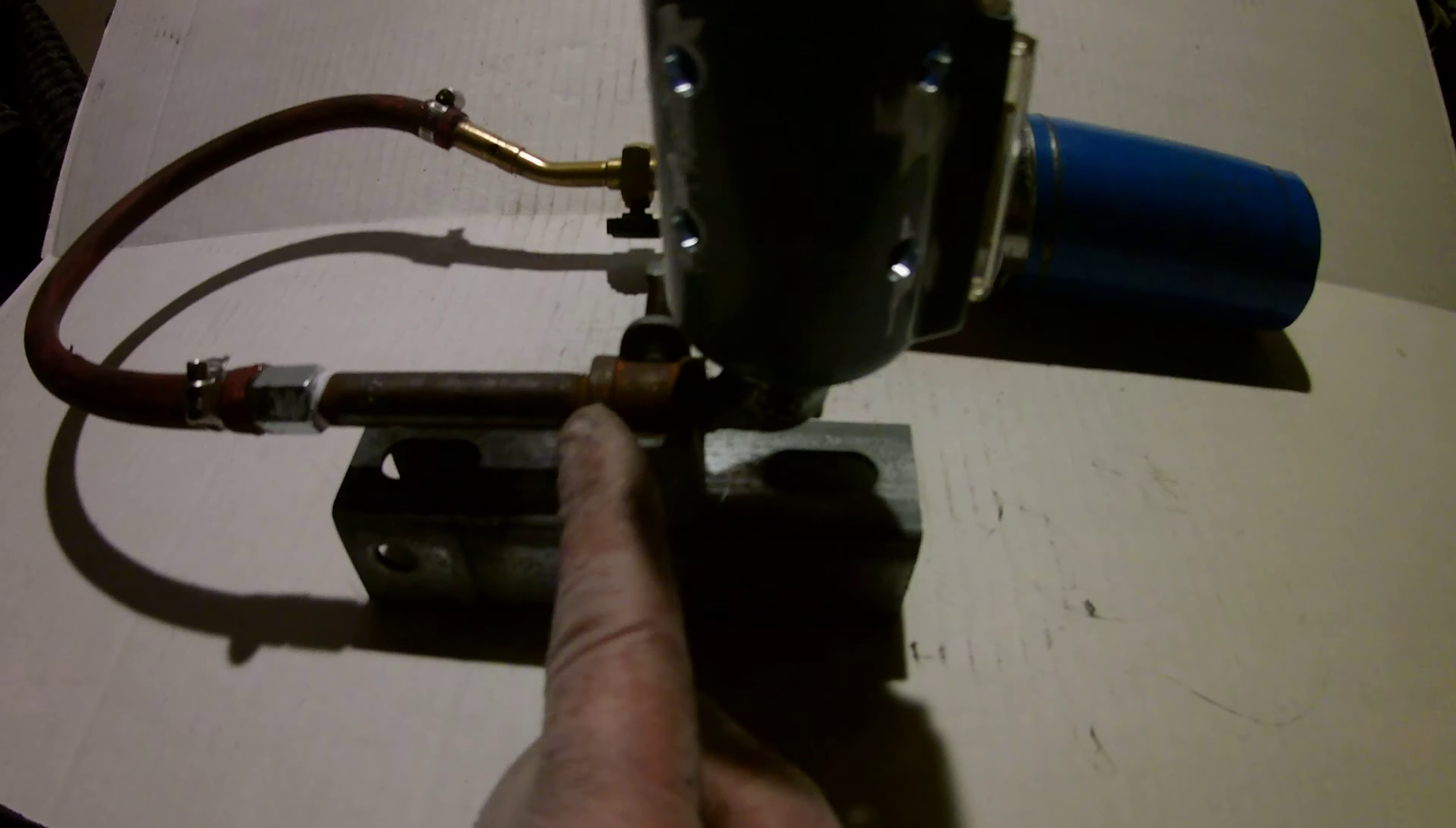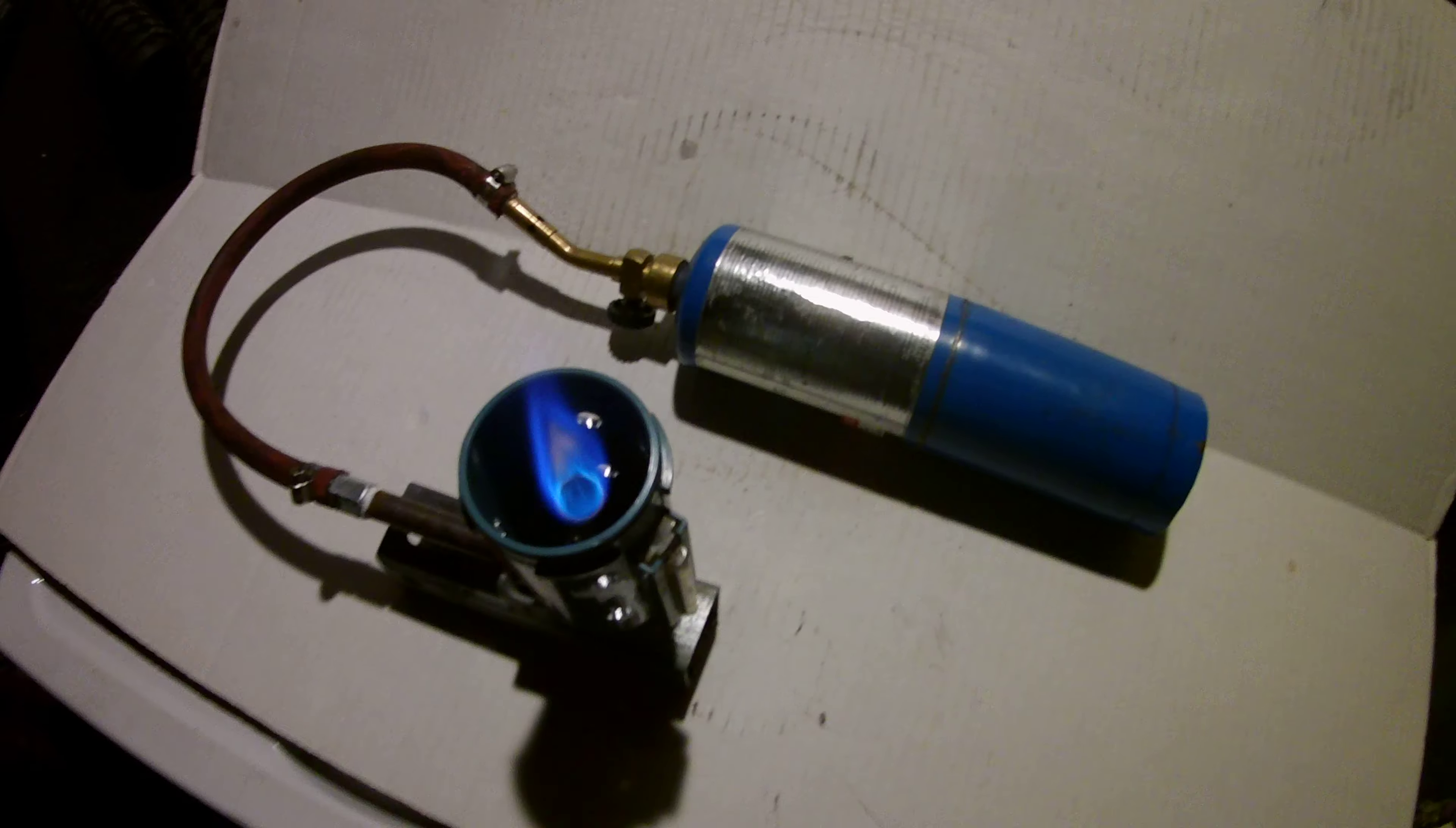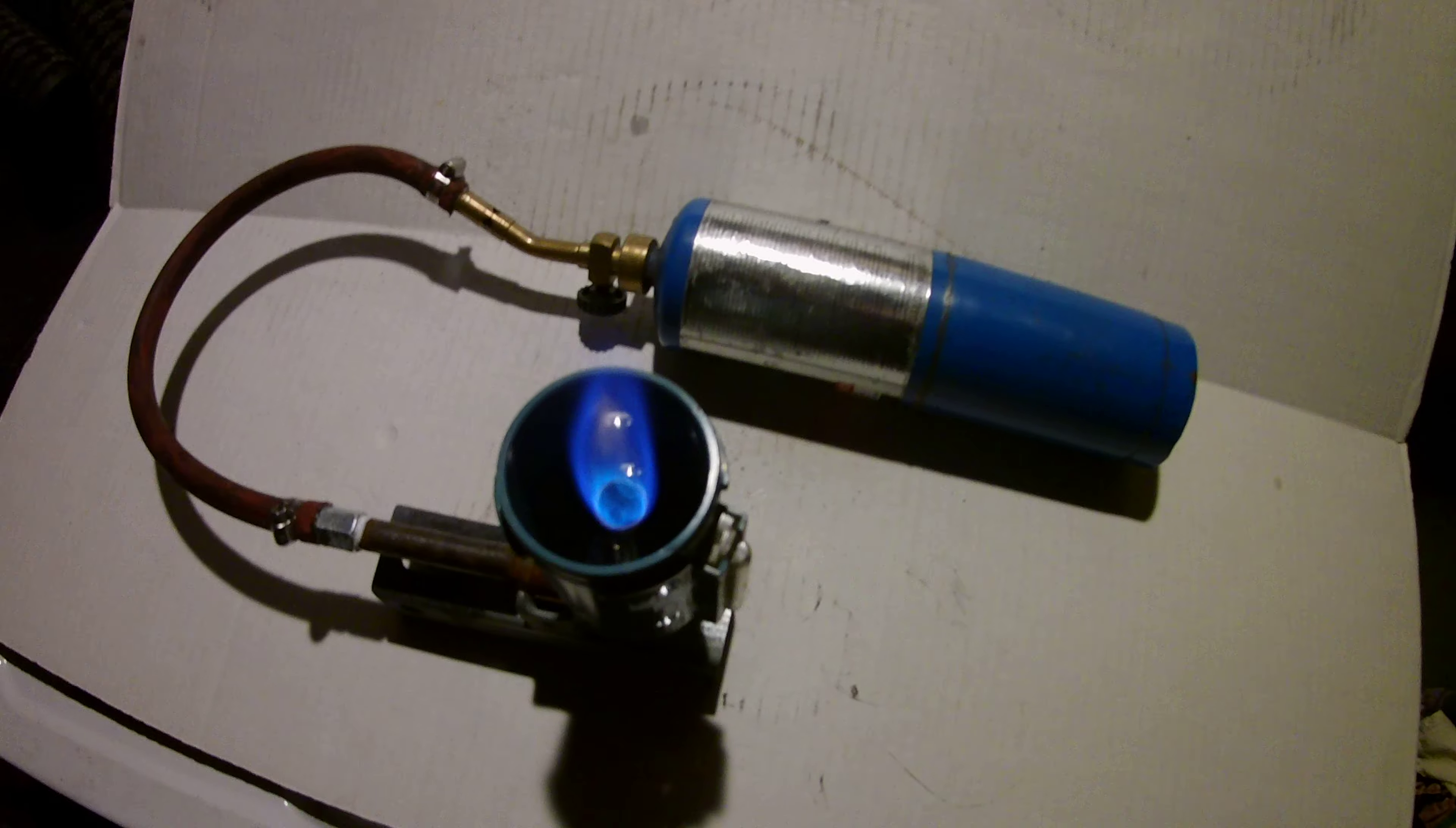And there you go, there's your detail. I've mounted it all to a clamp, into an old piece of a Unistrut for a base. And there you go, the home Bunsen burner.